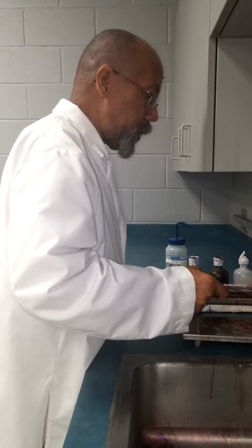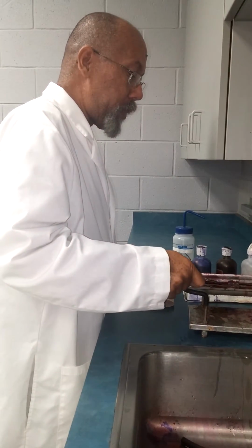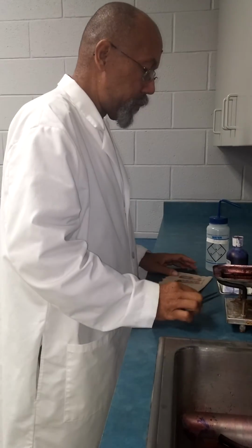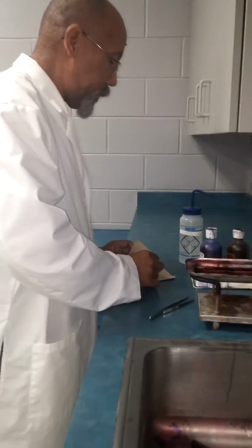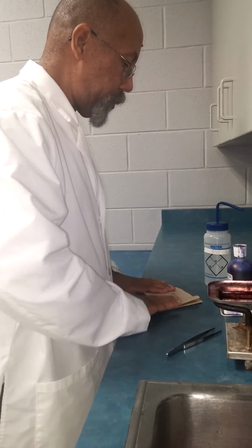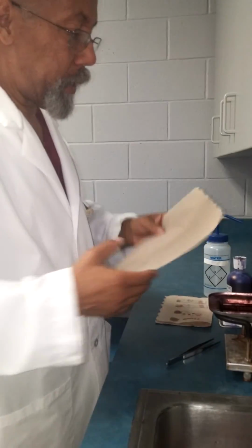I like to blot the slide with a paper towel because we have to allow the slides to dry, and blotting off the excess water simply allows the slides to be read quicker than if we let it dry.